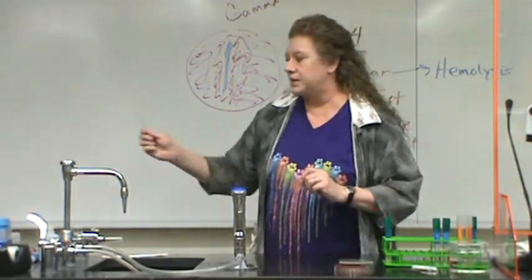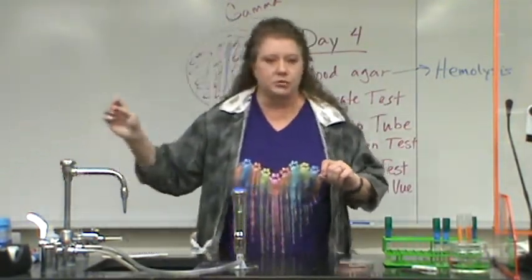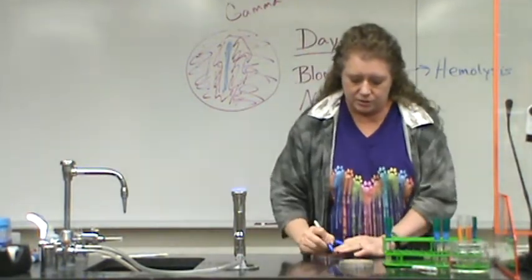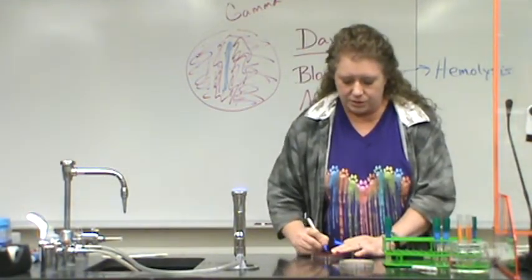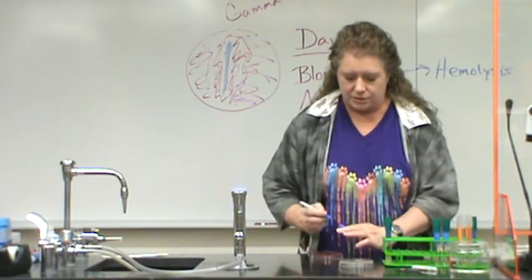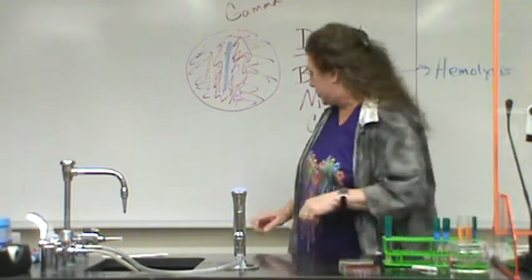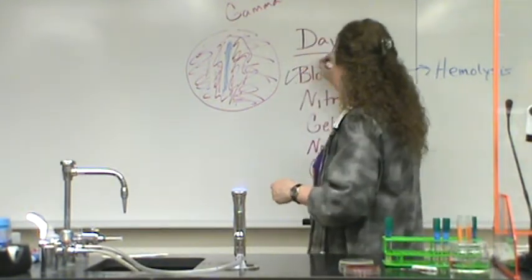Okay, so you put that aside, dispose of the swab. Make sure you've labeled everything. Okay, this is blood agar, and it's isolate number 1. Okay, so that's ready to be incubated. So blood agar, check.